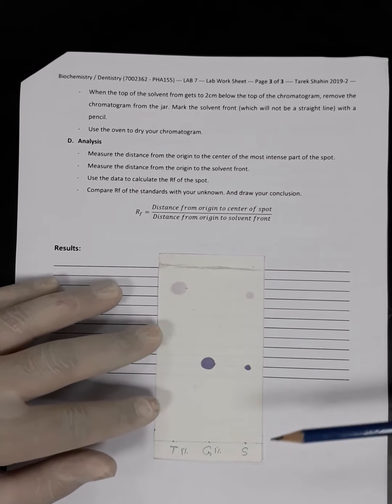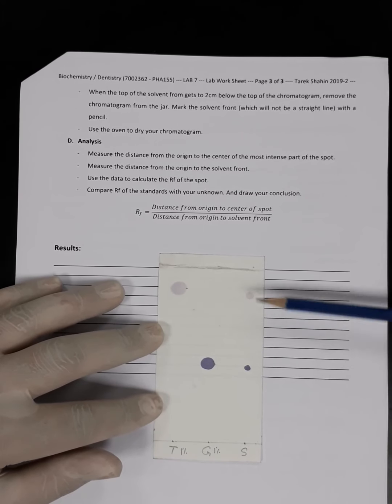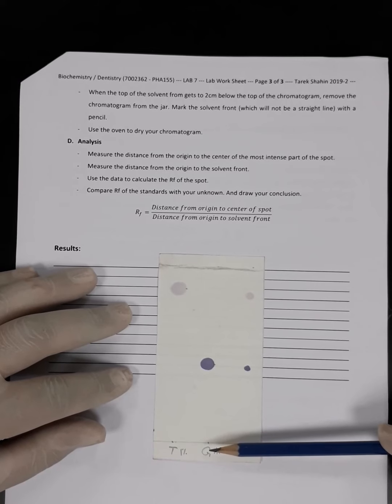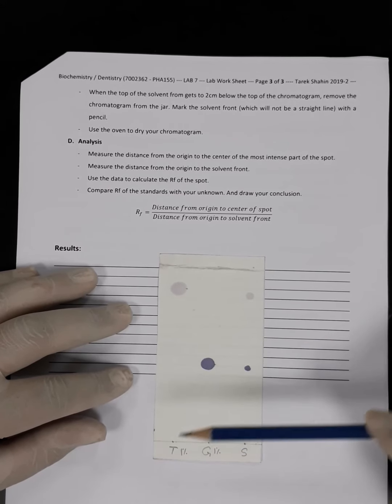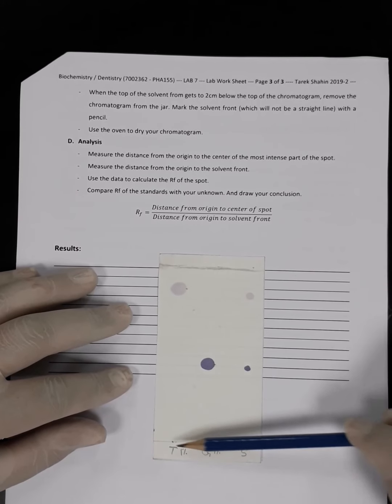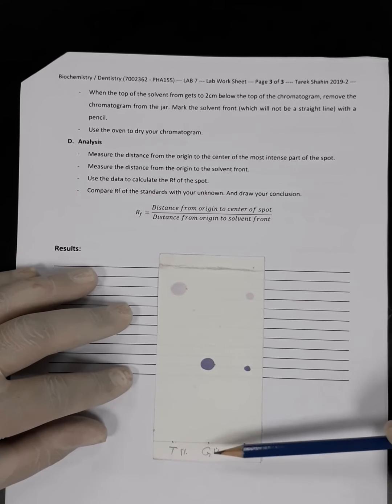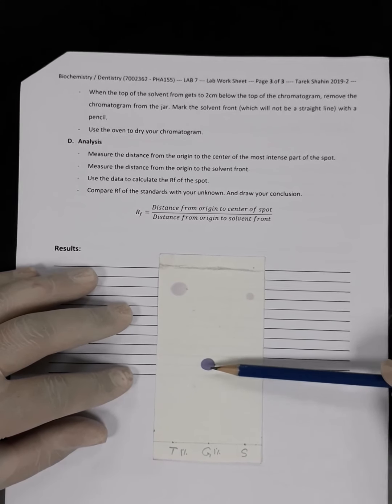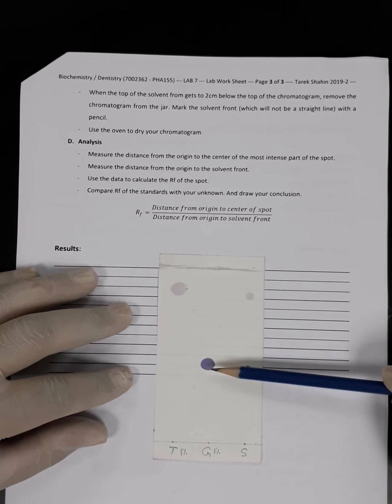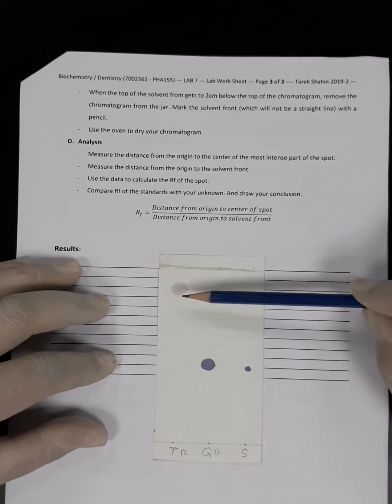If you look with me here, these are the spots of the sample. It gives us 2 different spots. And this is the spot of the standard glycine. It gives us only 1 spot. And this is the spot of tyrosine, which gives us 1 spot. Let's start with the standard spots of glycine and tyrosine, which we prepared at a concentration of 1%. You will find that the glycine traveled a shorter distance, while the tyrosine traveled a longer distance.